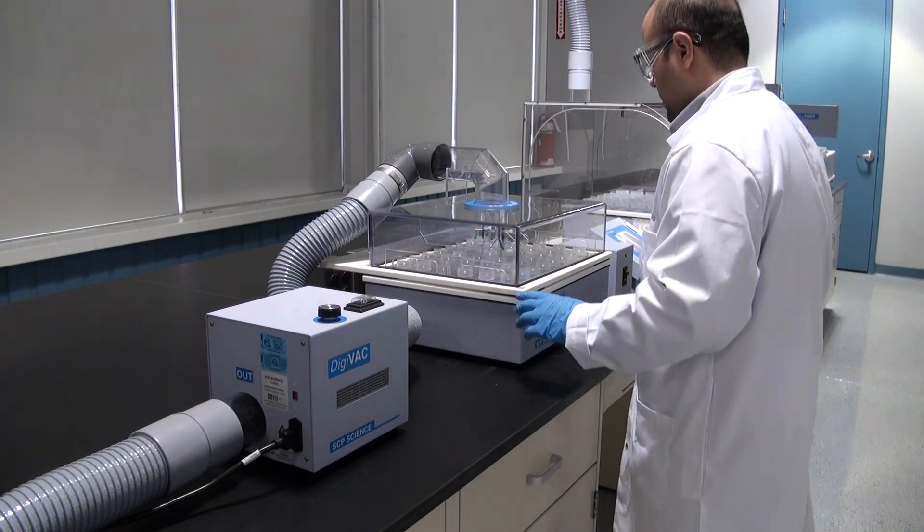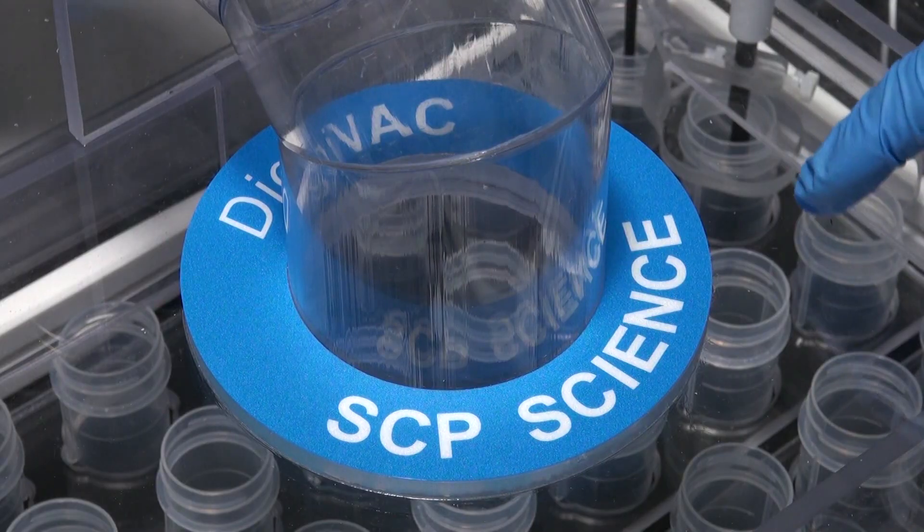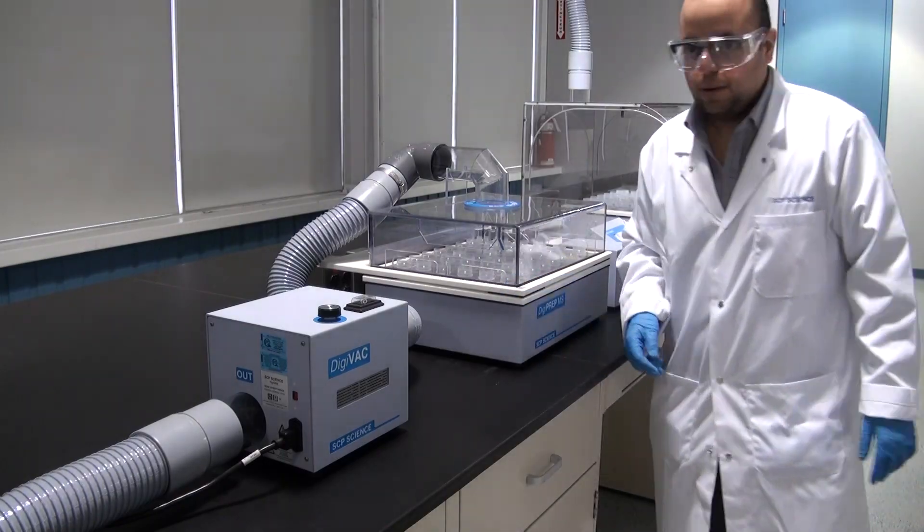The variable speed blower unit is attached to the exhaust hosing, which is attached to the transparent collection hood. Ports are also available to use Digiset or Digiprobe.